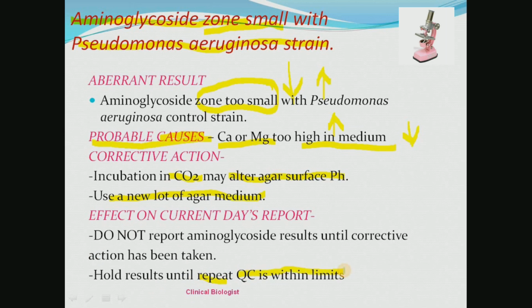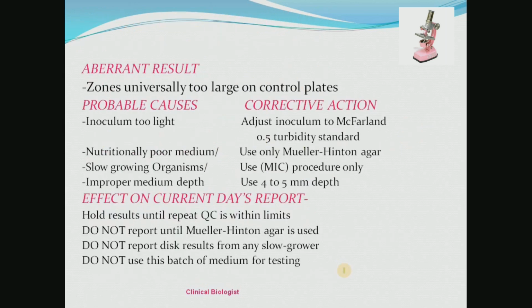Okay, this is a very important action in the troubleshooting of the antibiotic disc-diffusion test, for aminoglycosides. Before we discuss clindamycin and tetracycline, this is aminoglycoside. Very important questions they will ask in MCQ. So remember these points.